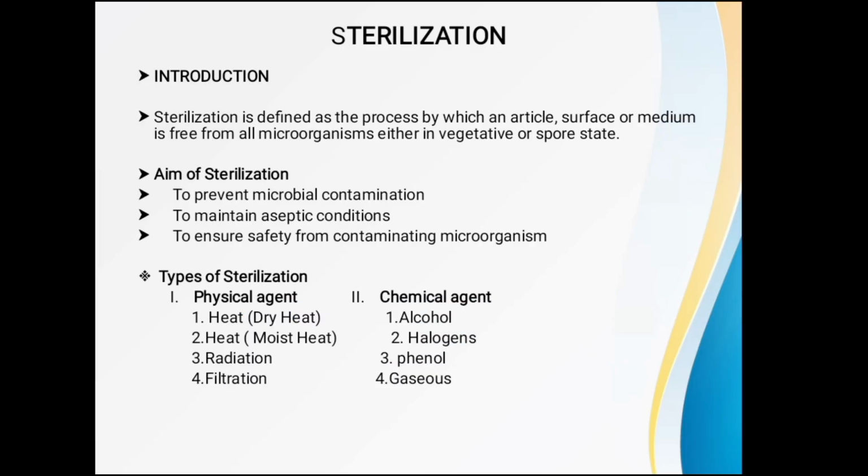First of all, introduction. Sterilization is defined as the process by which an article, surface or medium is free from all microorganisms, either in vegetative cells or spore state. Aims of sterilization: to prevent microbial contamination, to maintain aseptic conditions, to ensure safety from contaminating microorganisms.